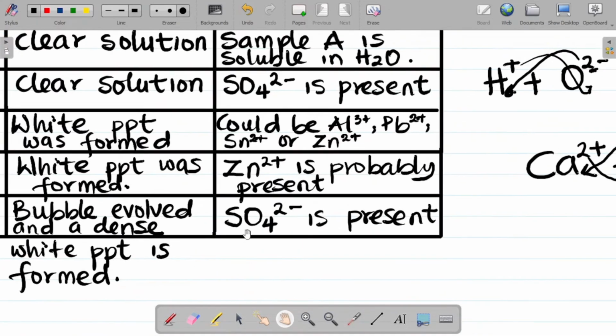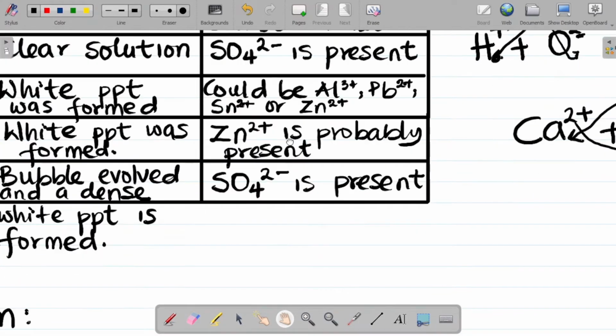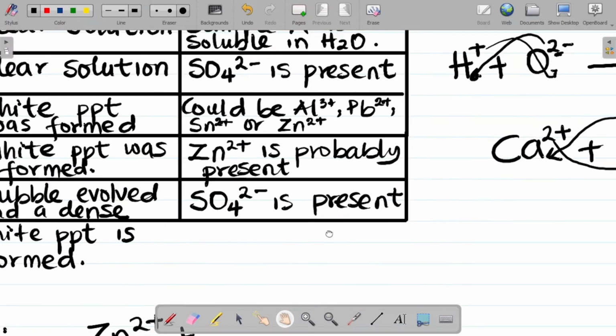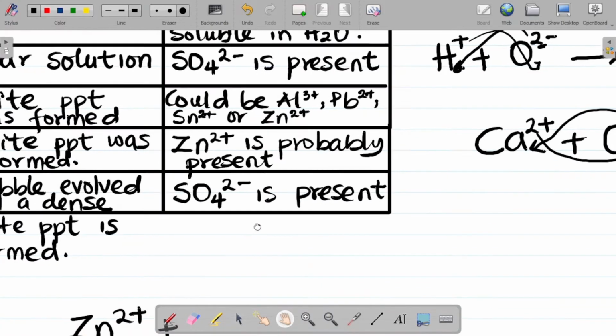So in conclusion, what compound do we have here? First things first, I can see that zinc appeared twice. That means probably the cation here is zinc. So I'll have zinc, Zn2 plus, combining with the anion, which is a negatively charged ion. For this, I'm seeing SO4 2 minus, tetraoxosulfate 6 ion, and SO4 2 minus again. So it's twice.